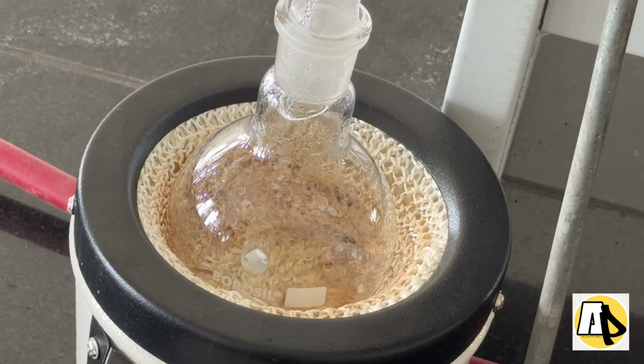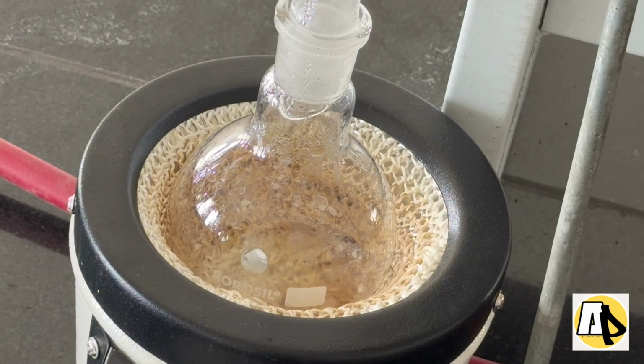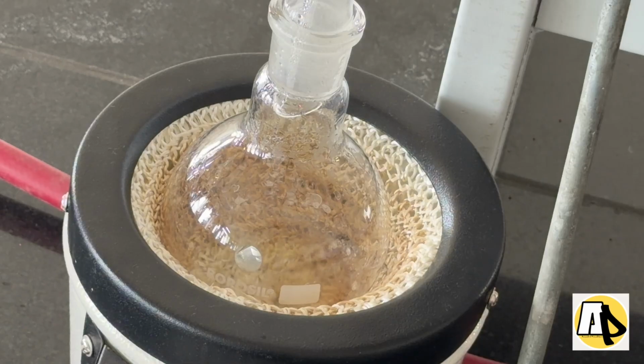As we saw in the theory part, in the reaction, methyl salicylate reacts with sodium hydroxide and forms sodium salicylate and a byproduct of methanol. So the methanol is getting refluxed in the RBF. So let us stop the reaction now by turning off the heat and then let it cool for some time. Not cold, I mean cool. So we can add HCl. We can acidify using HCl for the formation of salicylic acid.